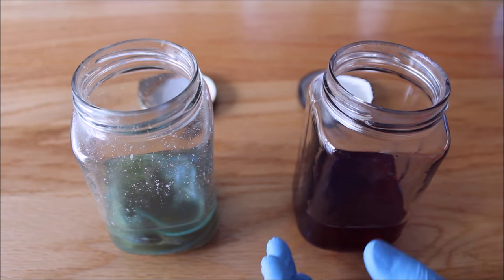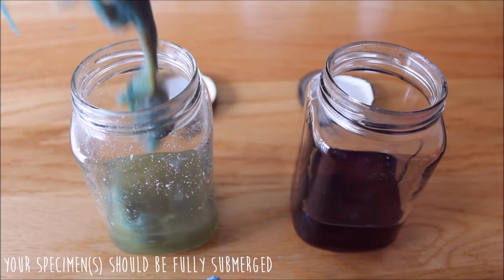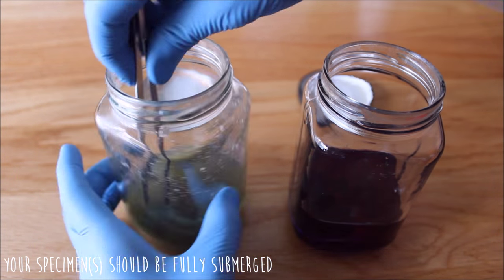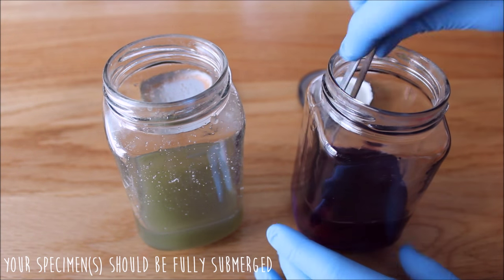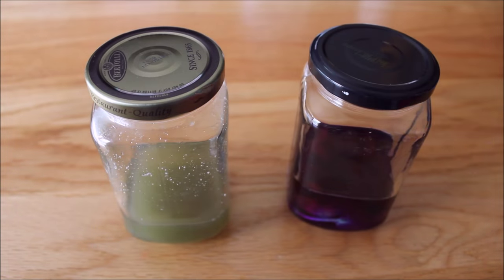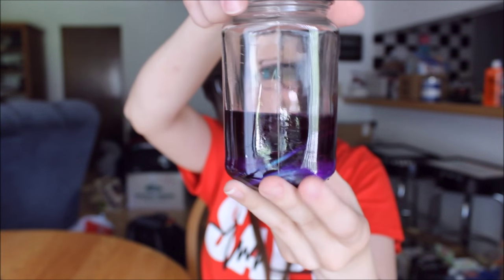We are now going to transfer our specimens from the trypsin digestion solution into the alizarin red bone stain. We've put our specimens in the alizarin red solution stain — you can't really see them but we're going to be leaving them there for about 24 hours.